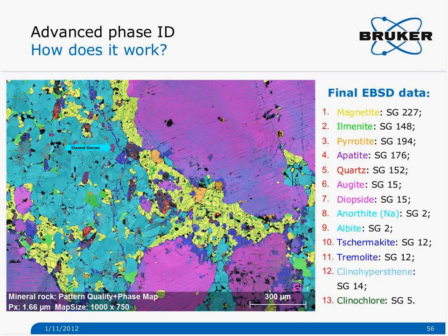It automatically looks into the data set and takes the band detection results around the pixel in question, and it's kind of doing an average, and that minimizes the risk of having one or two bands detected slightly off by doing this kind of averaging.